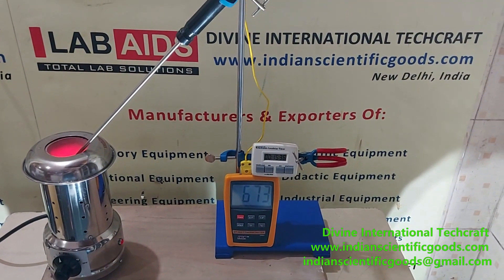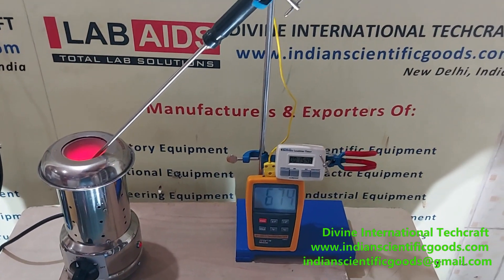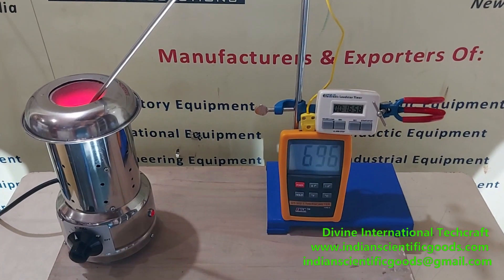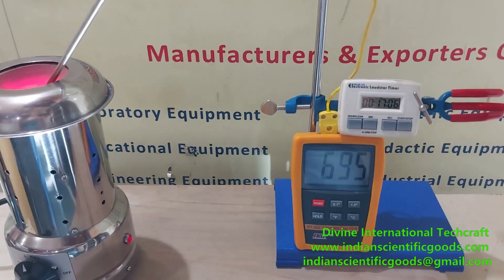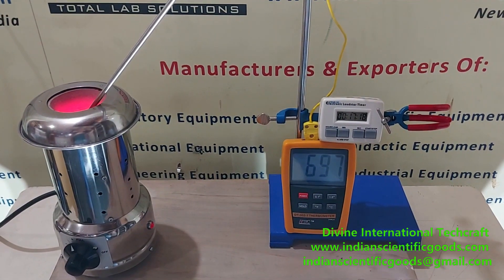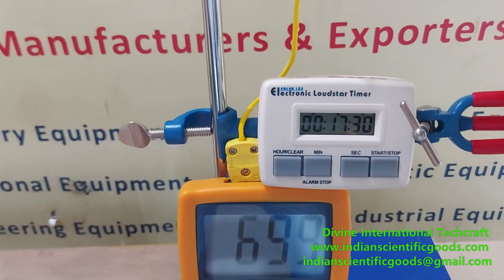You can use these burners for sterilizing small instruments also. These work on the principles of radiant heat. You can see that the temperature is about to surpass 700 degrees centigrade in about 17 minutes. The electric Bunsen burner has attained a temperature of 700 degrees centigrade within 17 minutes and 30 seconds.